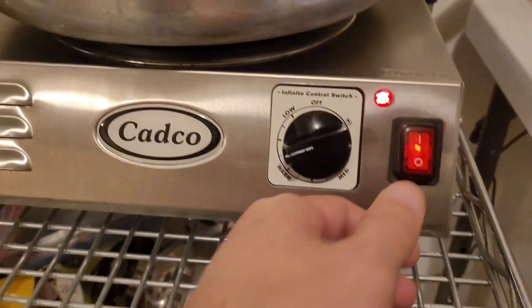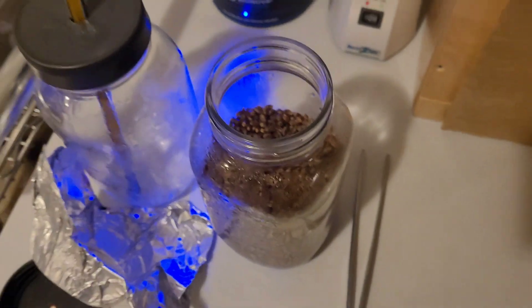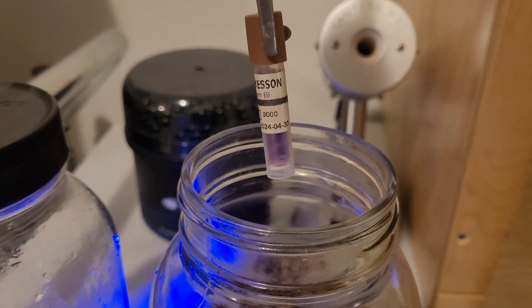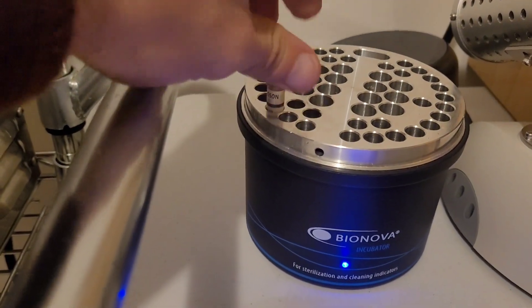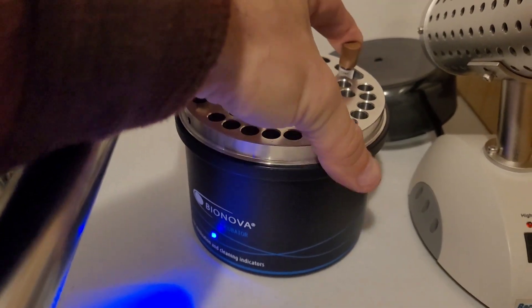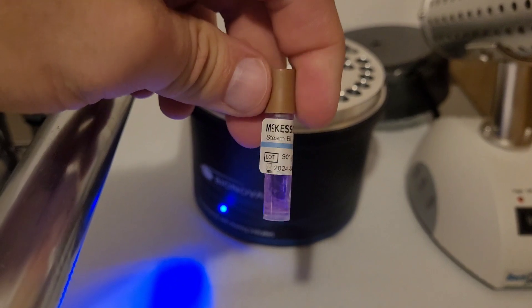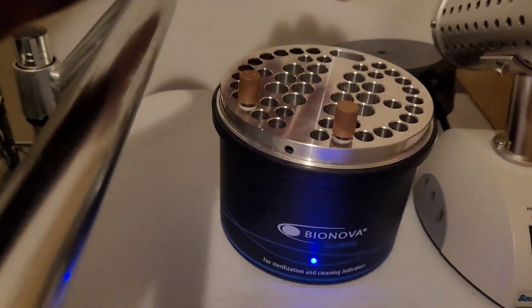The 90 minutes is up. Turn off the heat and allow the pressure to reach zero before removing the ampule. The blue chem strip has turned black. Crack the ampule like a glow stick and place it in the incubator. Now for the control — it does not have a black chem strip because it wasn't cycled. That goes in alongside the cycled ampule. Now it's going to sit in here for 24 hours.